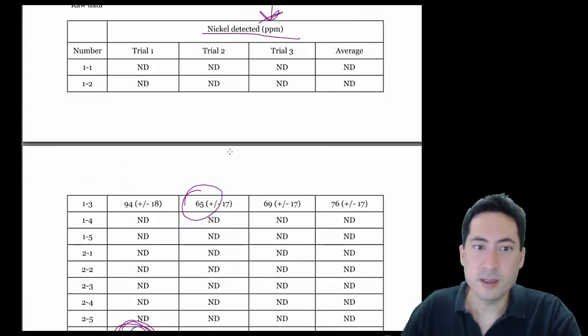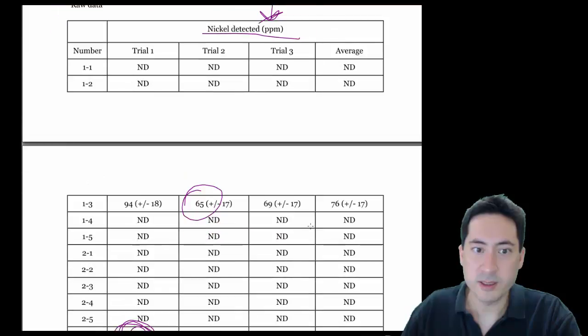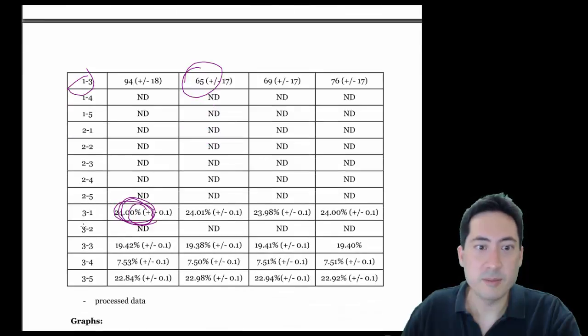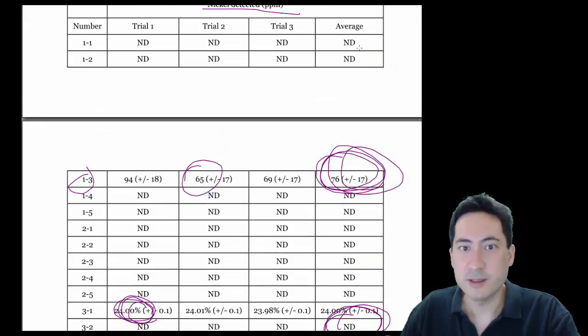Now this looks like a range of 5 repetition of 3, but then that wouldn't make sense because you're getting nothing on your first one, and then except for on 1 3, and then nothing on that. So is this a repetition of 5 and a range of 3, which would fit in with a few small anomalies, with this as an anomaly and this as an anomaly? I hope so, because otherwise it doesn't make a lot of sense.